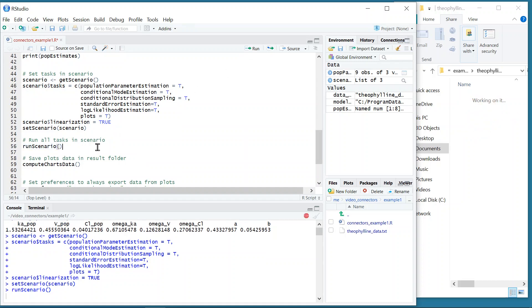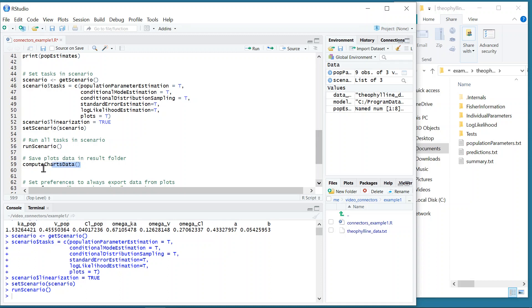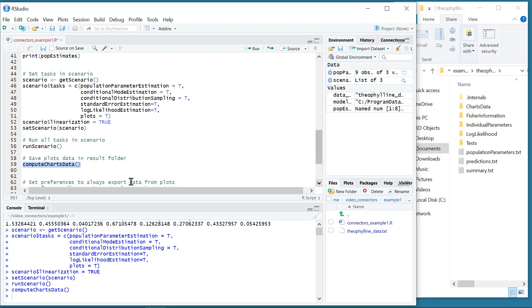Note that the task Plots cannot generate images without the interface. However, it can generate the data for all the plots selected in the scenario in the folder ChartsData, provided that the option ExportChartsData is selected in the Preferences of Monolix. In my case, the option is not selected in Preferences, so the folder has not been generated. Therefore, I need to run the function computeChartsData to save the plots data in the results folder.